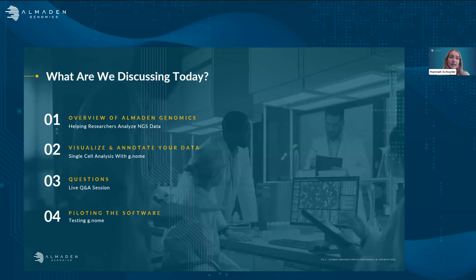So what will we be discussing today? We have a few things that we'll be covering. First, I'll go over an overview of Genomics, so who we are, where we came from, and how we're helping a variety of our different clientele analyzing genomic data. Then we will talk through how you can actually visualize and annotate your single-cell data with our guided workflows, allowing you to go from raw data to processed without having to use code. We'll leave some time for live Q&A at the end to go through any questions that you guys have. And then lastly, we'll be talking through next steps on those that are interested in testing and piloting the software as well.